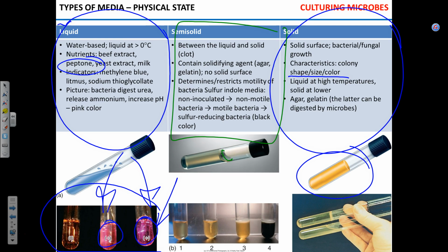That belongs to the microscopy realm. I see what you're saying. Oil behaves differently from water. It's more dense, it's more viscous, but it's not semi-solid. Take oil. Do I have the oil?